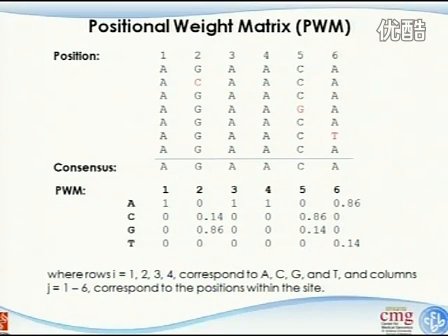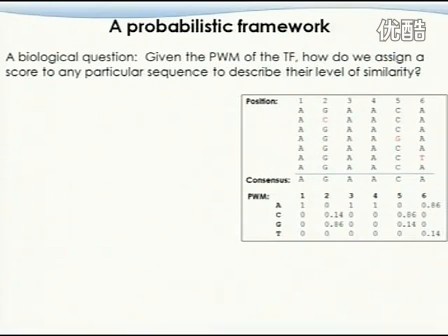So you see 100% in the first position is A, you put 1 here, right? And 14% is C, which is 1 out of 7 is C. You put 14% here, and the rest is G. So you just put the percentage there. And this is called a position weight matrix. This is a better representation of a sequence binding site. Okay? And most people are actually using this.